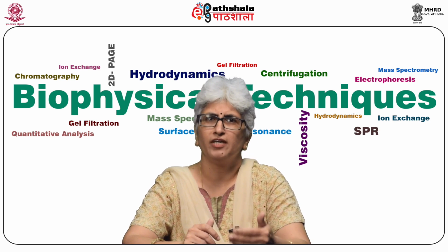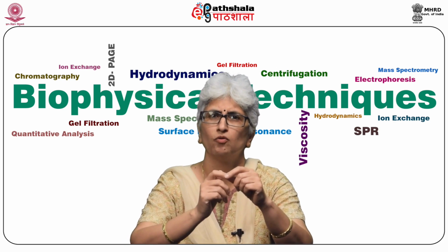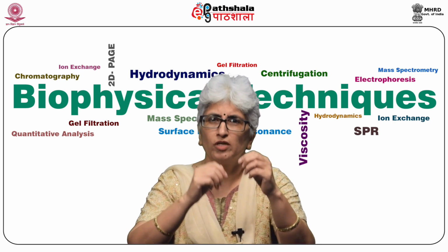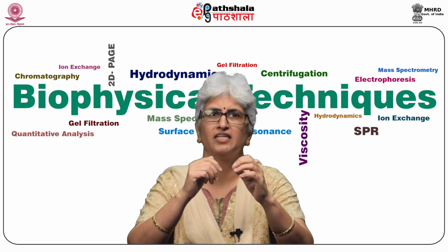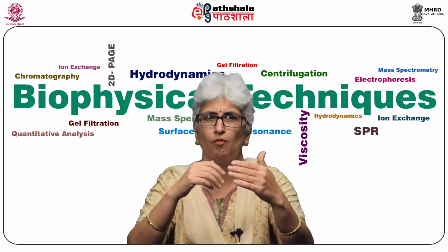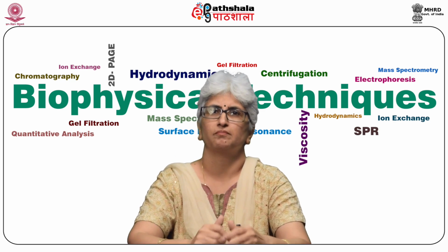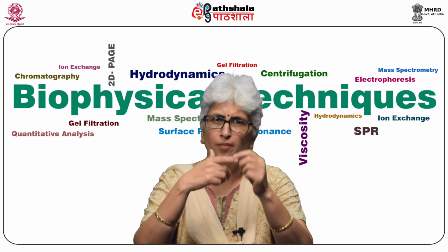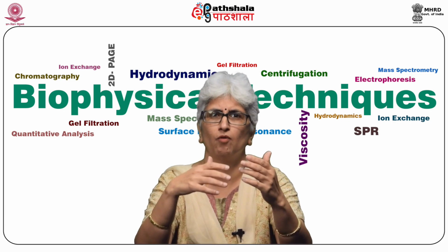The principle of affinity chromatography is solely based on the reversible interaction between the target molecule and the affinity ligand immobilized on the column matrix. The suitable ligand is selected based on the inherent recognition site present on the target molecule, in such a way that the binding between target molecule and ligand is very specific as well as reversible. The affinity chromatography process has three basic steps: sample loading, washing of non-specific molecules, and elution of the target molecule.